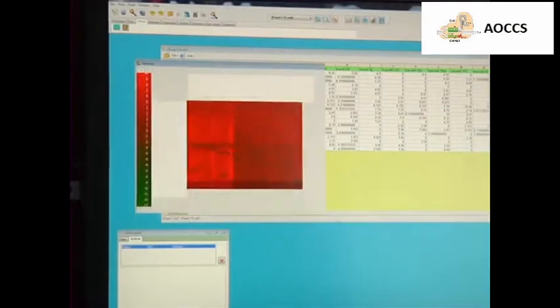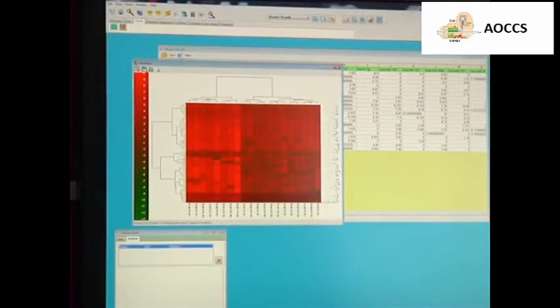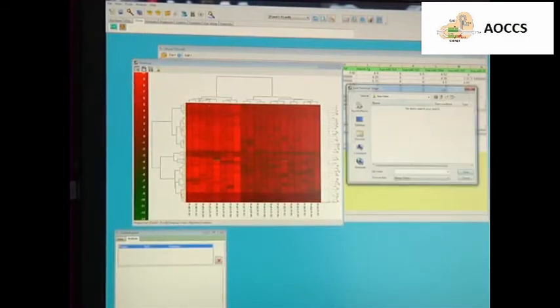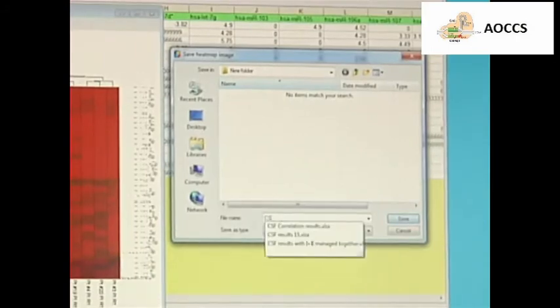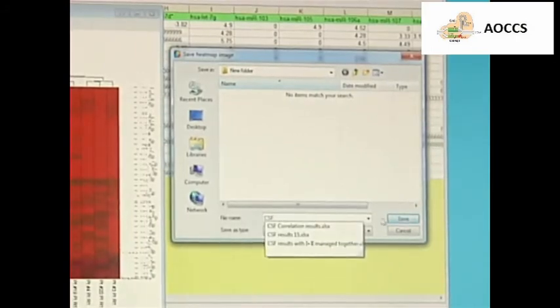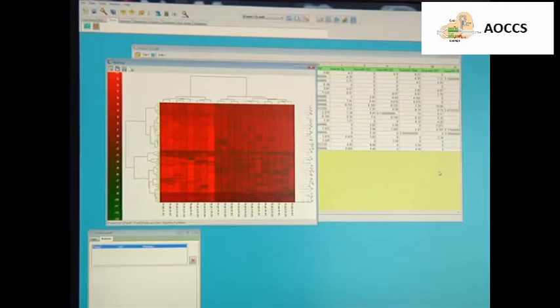Next, in the Control Panel window, click Run. Save the heatmap in the desired format, such as TIFF or Bitmap, and then copy and modify the heatmap as needed.